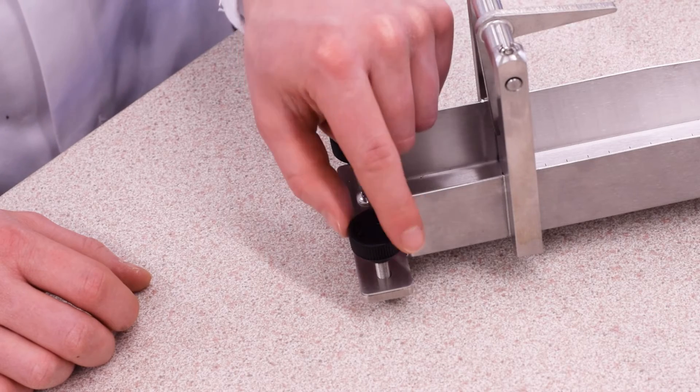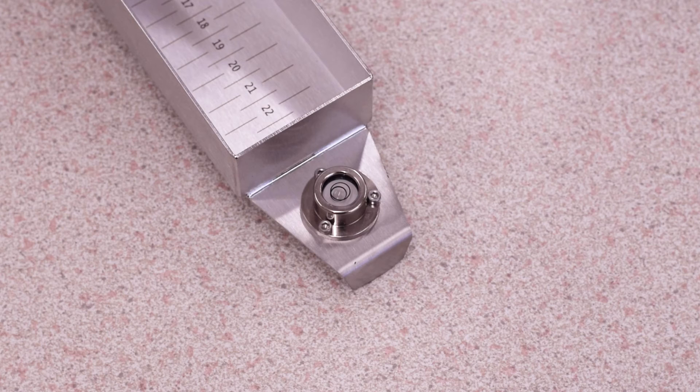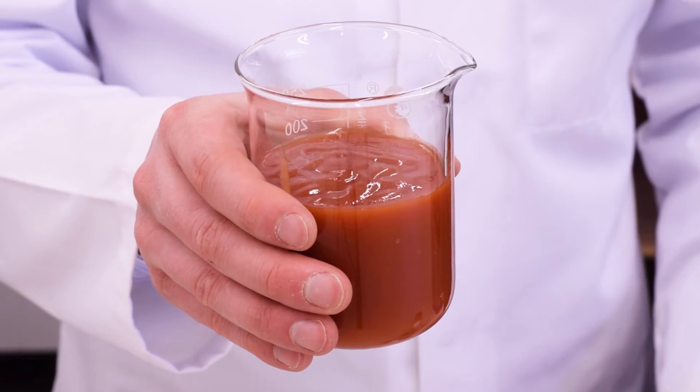Firstly, you need to ensure the consistometer is level by adjusting the feet so that the level bubble goes into the circle shown. Before you start testing, make sure your samples are at a constant temperature to ensure accurate results.